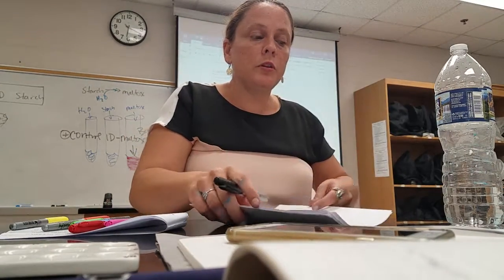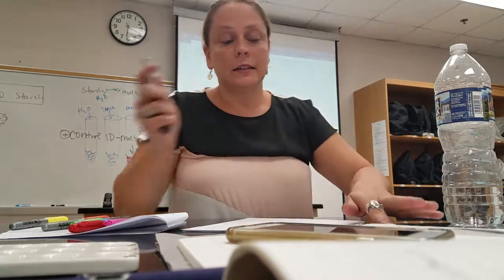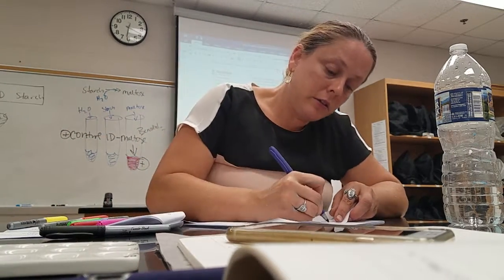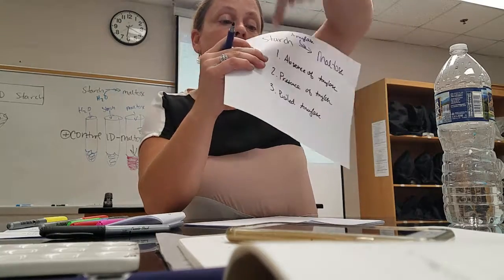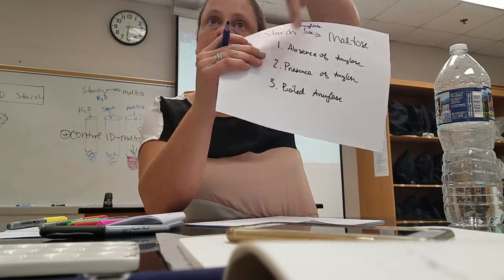Okay, we're going to use Lugol's first to detect all of our variables here, except for amylase. Because if you think about it, amylase and what we're doing with amylase, these are your experimental variables. These are what we want to test.